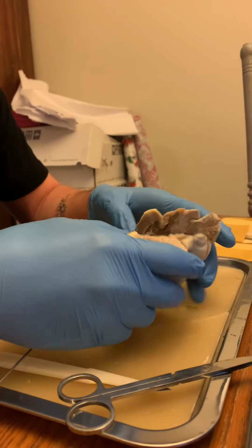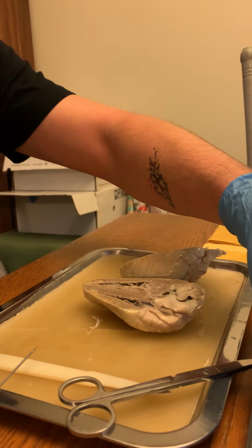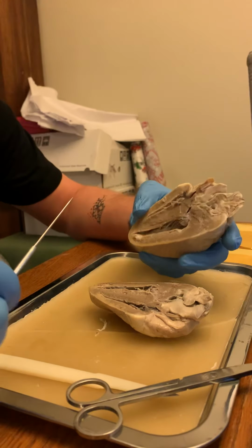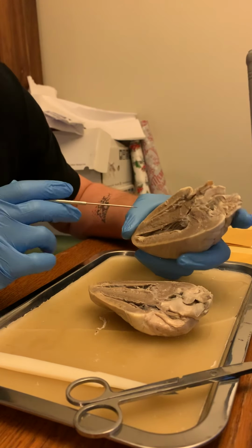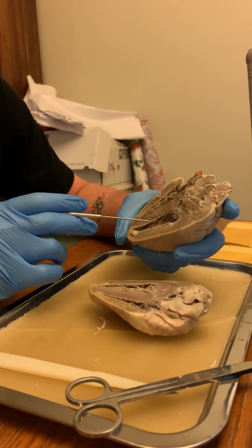Now, as we split it open, the myocardium is the thick and meaty part of the heart, and the endocardium is the inner part where the blood touches.